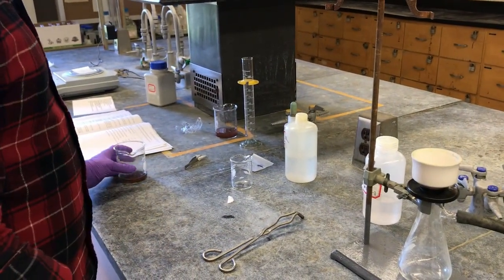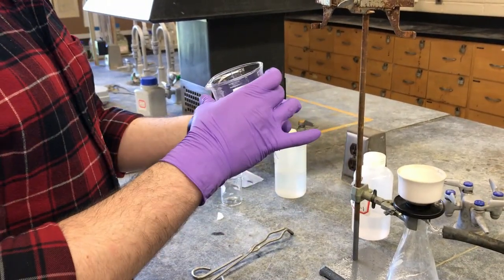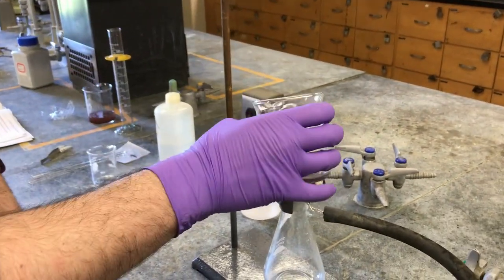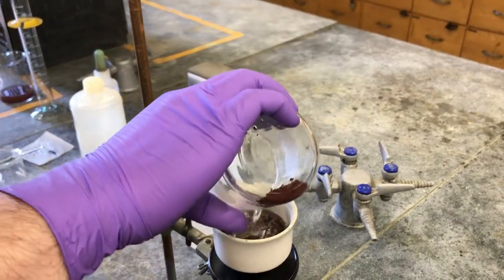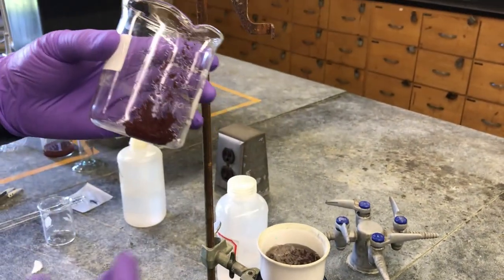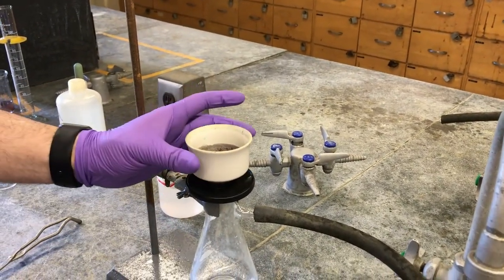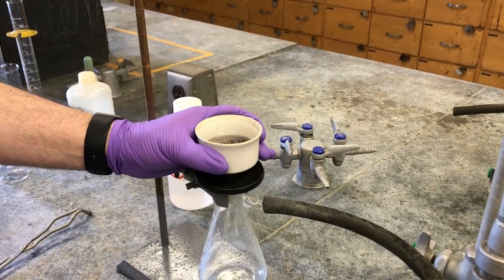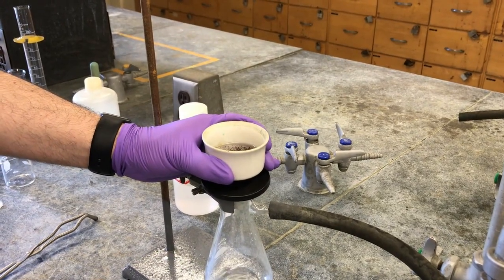So right now we have our copper solid, and we want to carefully but quickly dump it in here. And it's okay if you don't get everything. We still have a lot left, but we're going to wash this out. Now it looks like the water is slowly dripping, but we can carefully squeeze down and allow the water to drip down into the flask itself.